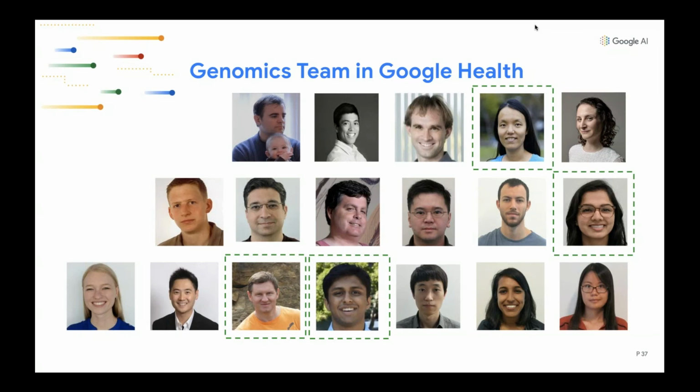Okay, thank you. And sorry to jump around, but just so that we have time to get both people answering questions, I'd like to jump over to Andrew now. Will DeepVariant be trained for long-read RNA-seq data, both PacBio and ONT, including cDNA and direct RNA-seq on ONT?